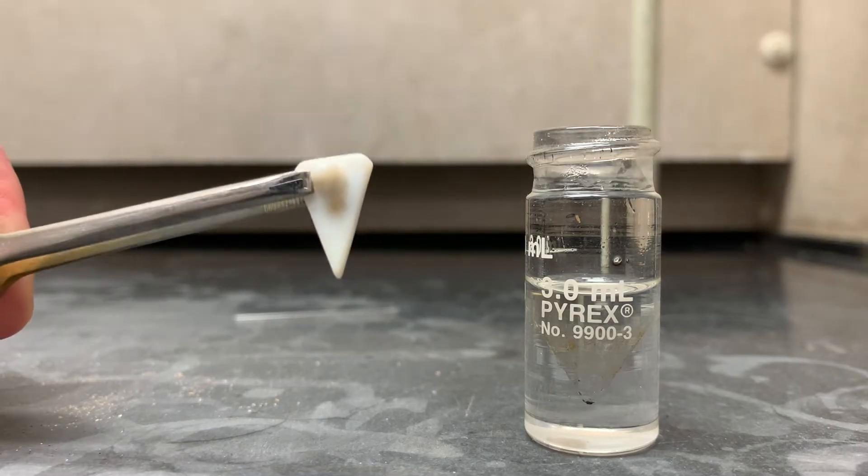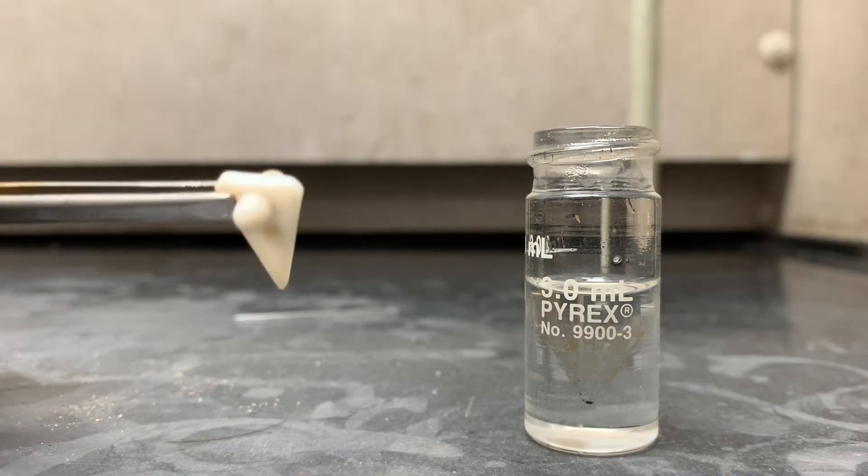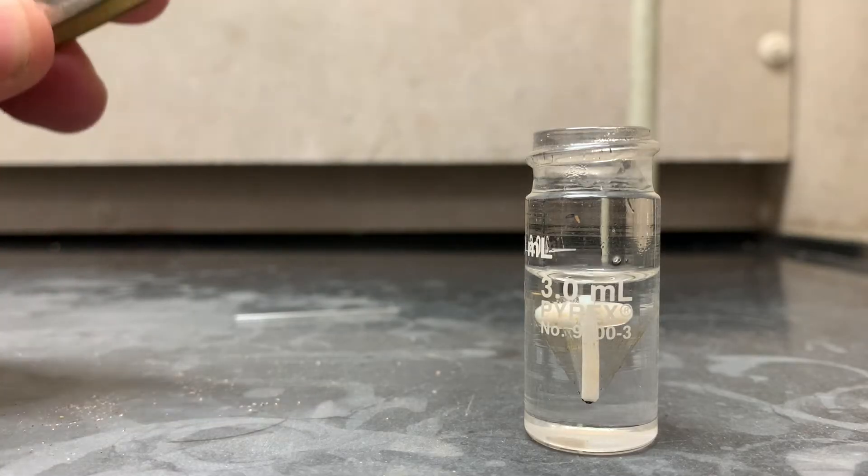You will also need a spin vane — you can use a boiling chip, but spin vanes are usually better. Make sure that when you put it in, it is point down; otherwise it will not stir properly.